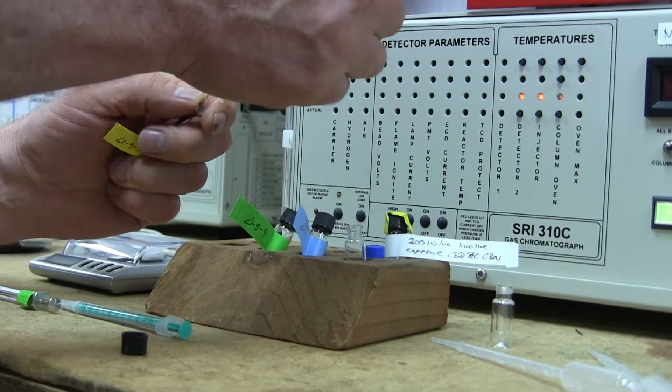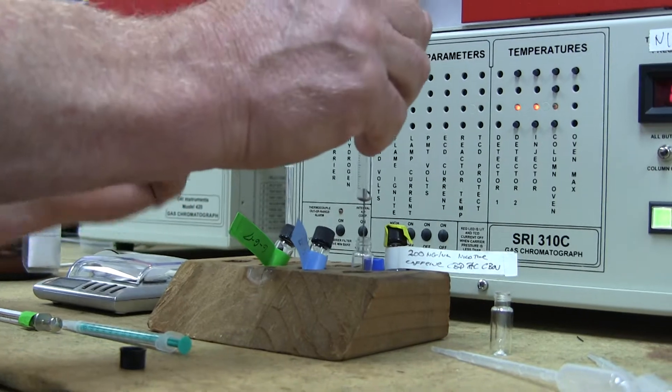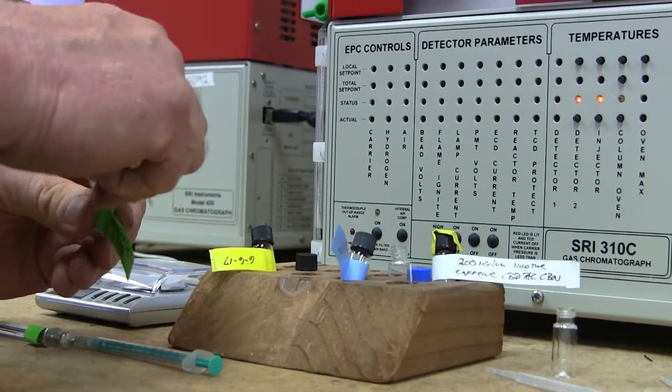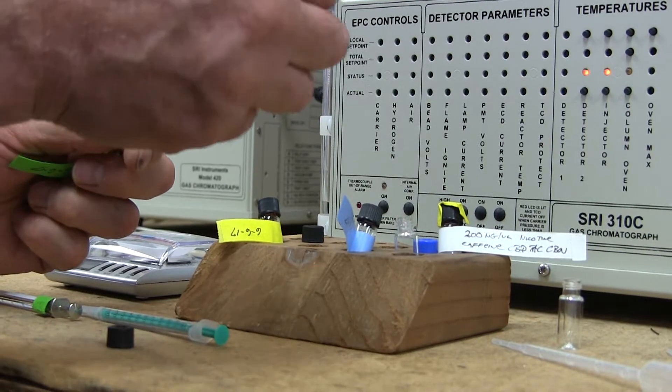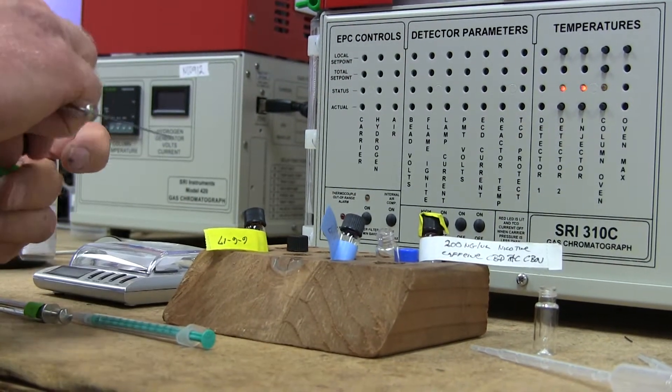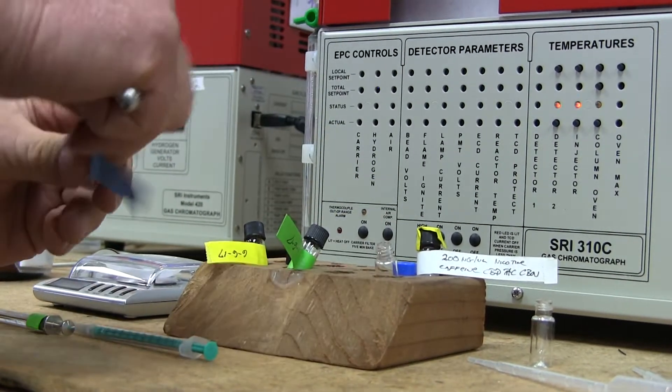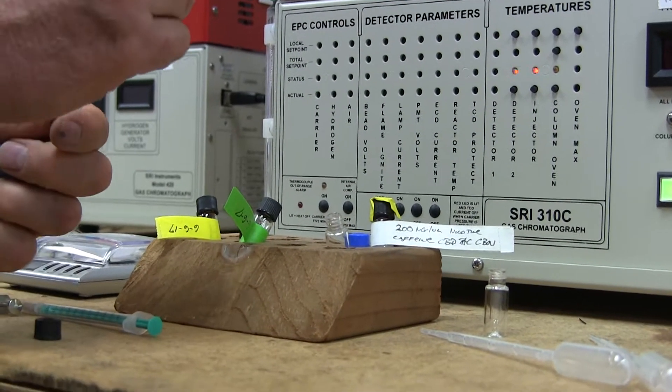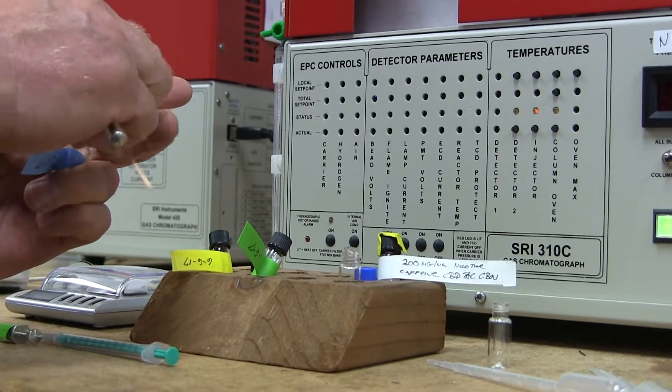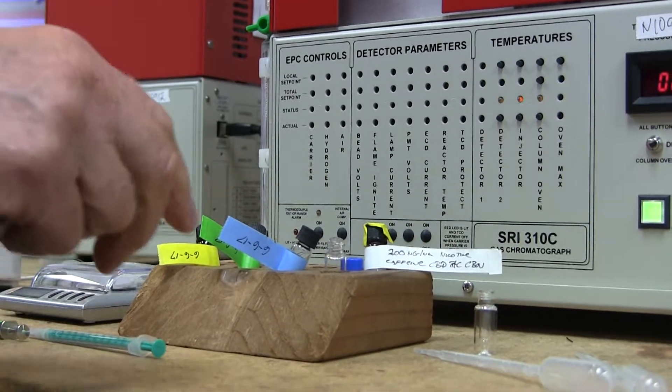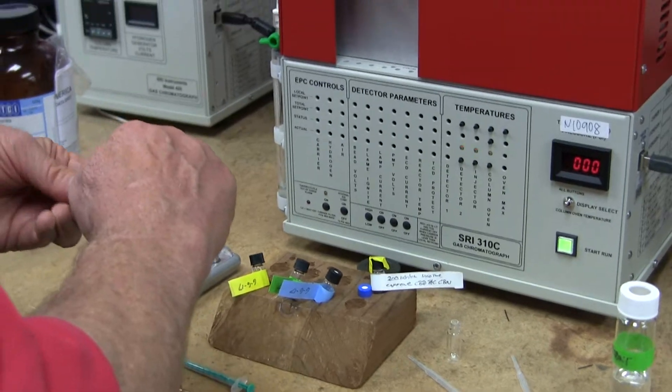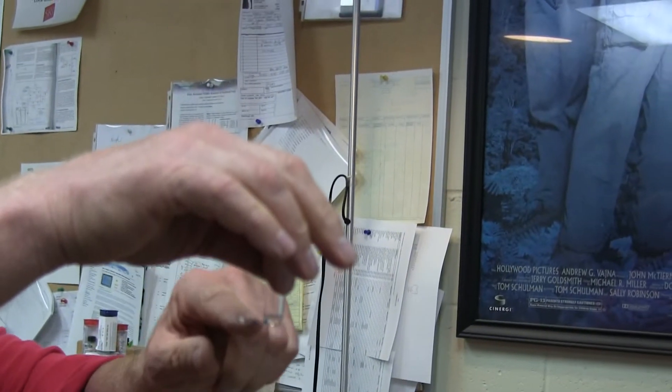So, what I'm going to do is I'm going to take 100 microliters of each one of these. So, here's the CBN, 100 microliters into the bottle, and then I'm going to take 100 microliters of the delta-9 THC, put that in the bottle, and then 100 microliters of the CBD into the bottle. So, because I mix the three together, even though each one originally was 1,000 nanograms per microliter, when I mix the three together, now the concentration becomes less, it becomes 333 nanograms per microliter.